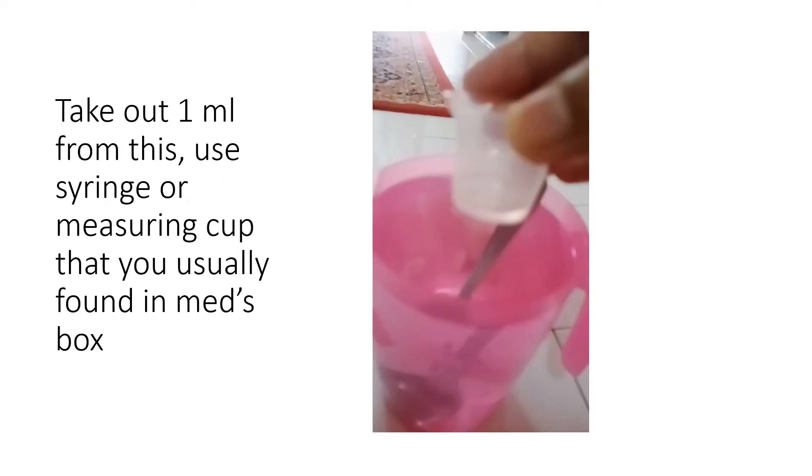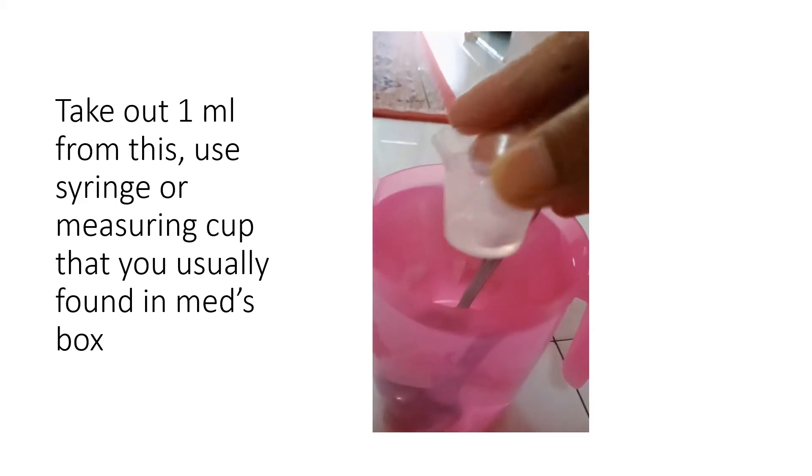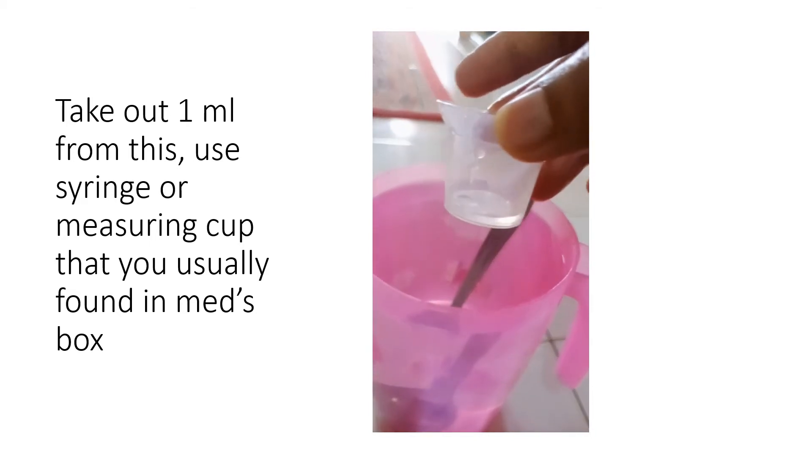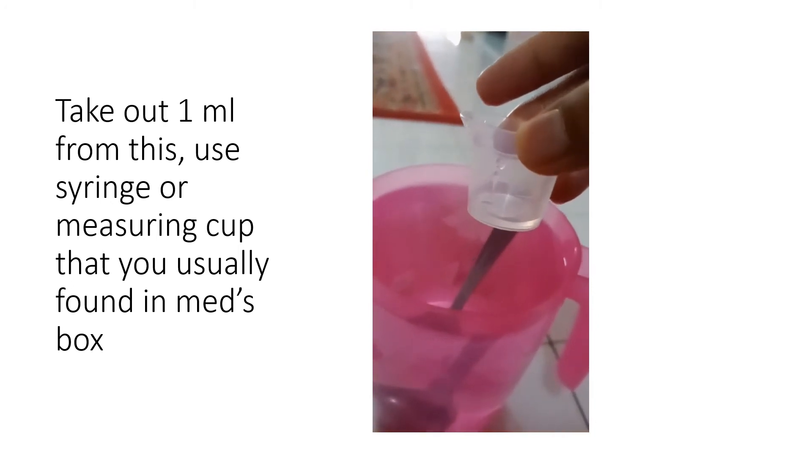Next, after everything has been dissolved, take out 1 milliliter from the 25 over 1000 solution. This 1 milliliter contains 25 grams in 1000, and we're going to use this to dilute it. You can use a measuring cup from a medicine box, or sometimes a syringe from a medicine box, which is even better than this cup.